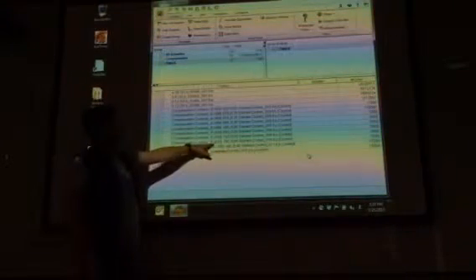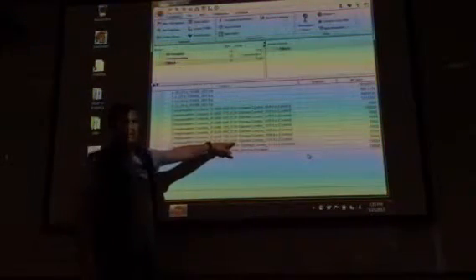It's labeled with things like lineage FITC, CD45 APC, and so on. So I've labeled it according to the color of the antibody that's been used. However, the way the machine does it is according to the laser and then the filter set which is used.